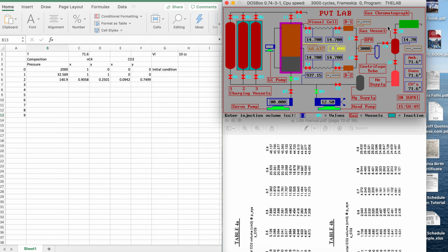I remove minus 5 again. So I try to find a bubble point, and now it seems that my mixture is more compressible. Okay, so now I passed the bubble point. So I need to shake this.